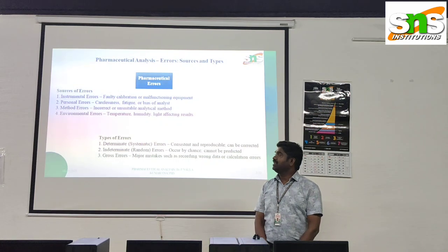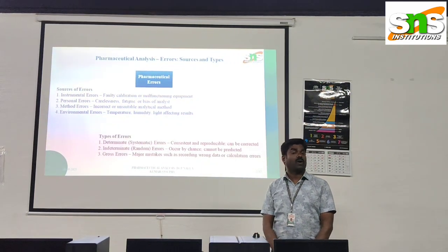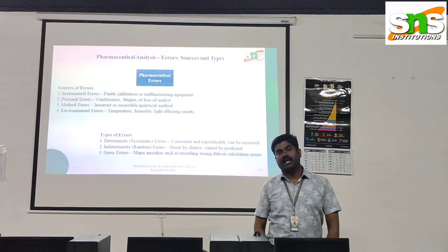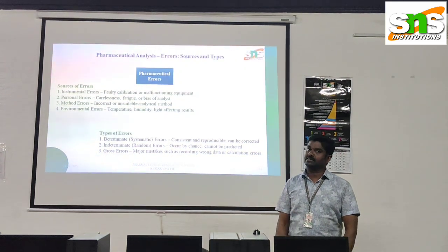Carelessness, lack of calibration or lack of maintenance will always end with errors and a low accuracy level in your test result.